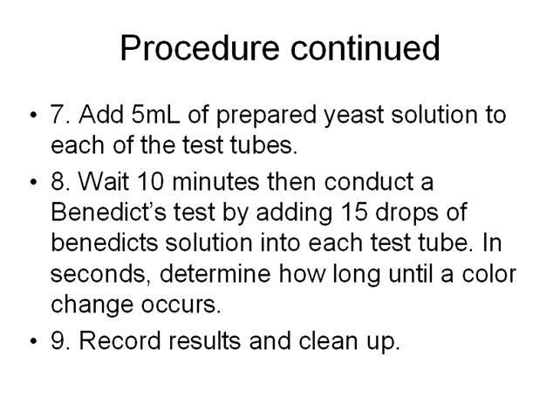As soon as you put it in there, if I were you, I'd put all 3 of them in there if you can. If you can't, it doesn't really matter. You can do one at a time. But just for time efficiency, you may want to do all 3, or if you can only do 2, then just do 2. You want to clock how long it takes to determine the color change. After about 45 seconds, if the color hasn't changed, it's not going to. So go ahead and pull it out and then record your results. And then step 9, record your results and then clean up.